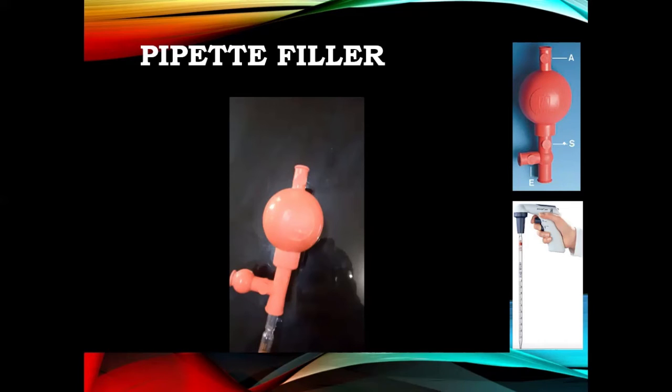Then the second point is S. S means siphoning. Siphoning means to suck the liquid. Some people say S means suck. Yes, it is for sucking the liquid or siphoning the liquid. When you press it and the pipette is in the liquid, it will help to suck the liquid. So you can suck the desired volume of the solution or any liquid by pressing this.